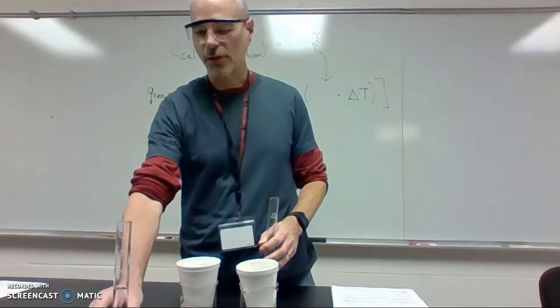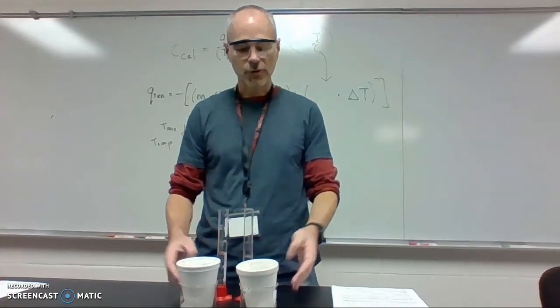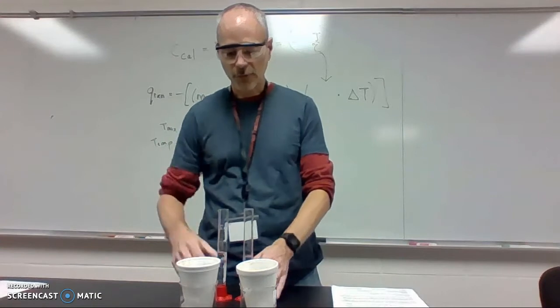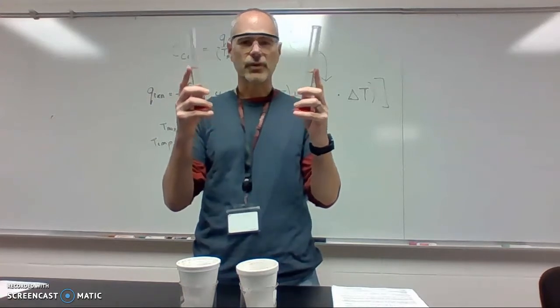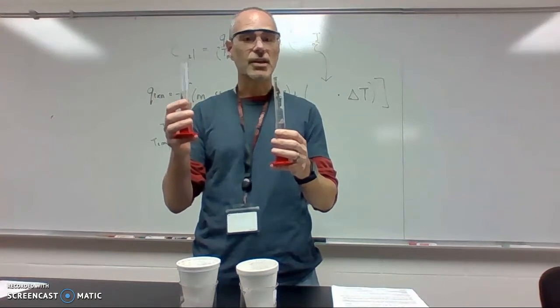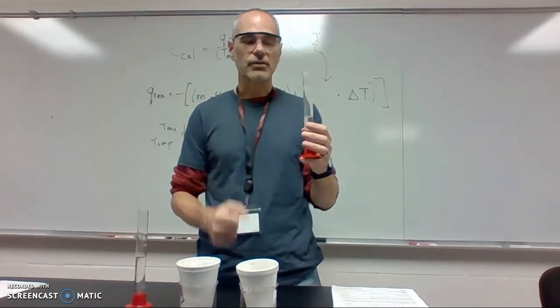All right, we're going to take a look at the thermochemistry lab, the Hess's Law lab. And the first thing we're going to take a look at is the 4 reactions you go through. The first one involves just water solutions. So you have 2 volumes of water, say 30 mils, 50 mils. And one of them is room temperature, T cool. The other one is something you heat it up to, 70, 80, 90 degrees Celsius.